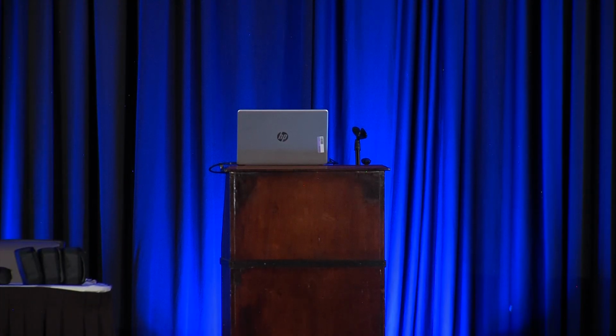Hi. Thank you for the presentation. And how do you demonstrate compliance to the EPA regulations for the biogas GC? Okay, so what I meant is that for biogas, raw gas, EPA requires that the producers have to at least give a measurement update every 15 minutes. It's not like a certification process, it's just a requirement.